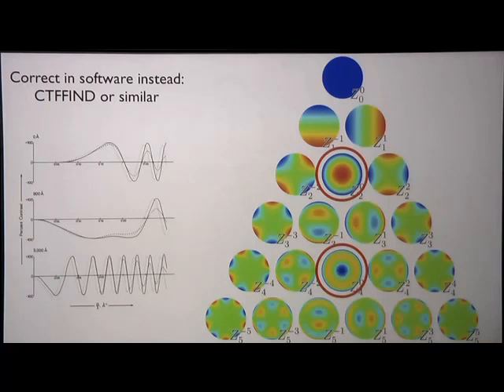There's another little detail that I'll just mention in passing: we actually take advantage of spherical aberration because of the difference between these two. This is the defocus, this is the spherical aberration. What I haven't told you is that spherical aberration is constant for a lens. It's a property of the geometry of this thing and how it was built, so it doesn't change with the current to good approximation.